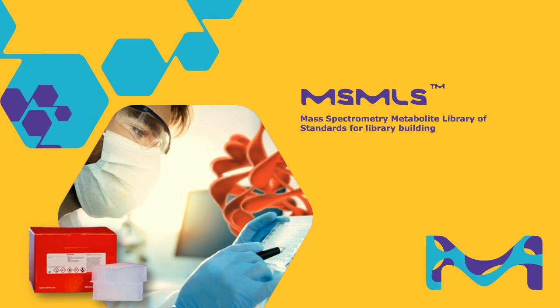Hello, and thank you all very much for joining, and thank you for the introduction. As part of this presentation, I will discuss the use of metabolomics standards for mass spectrometry and show you how to create a library using authentic standards together with a software tool.